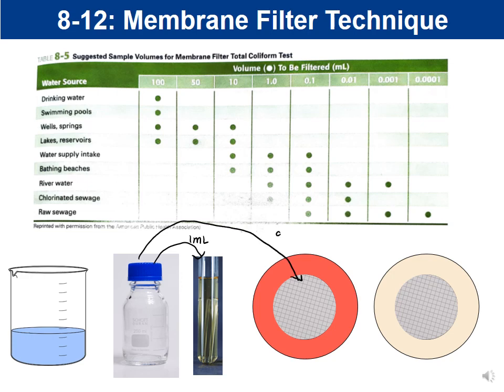So we would pour the water through the filter setup, and then we would take that filter and place it on our Endo agar.